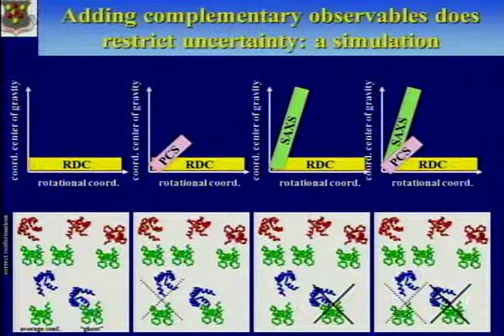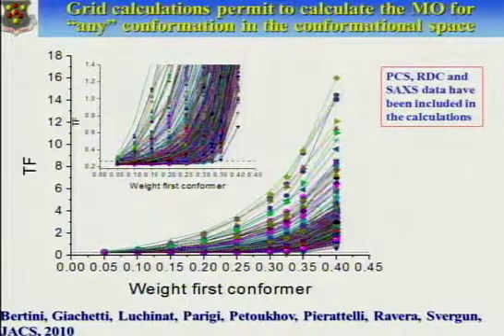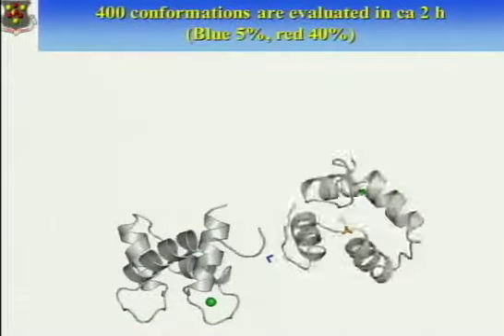So this is the kind of profile you get for 200 or 300 configurations. You see that there are configurations that go very high immediately and others that stay flat until you reach relatively high values. But as I was discussing, this is just a relative scale. So you can get different configurations and you can generate these plots easily. That's actually one of the outputs of the portal, and you map this cloud of possible configurations with the different colors.